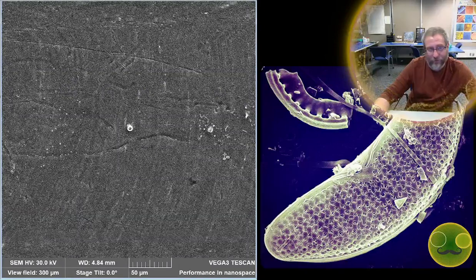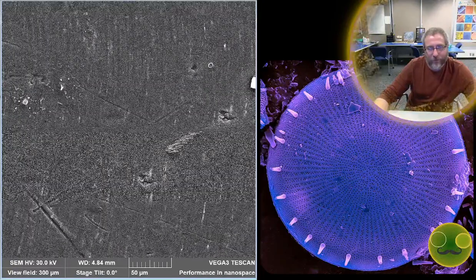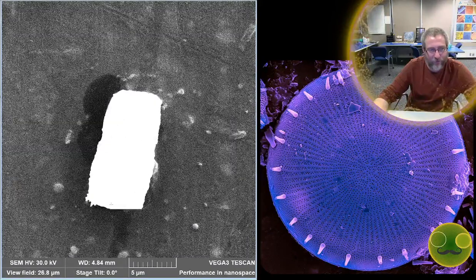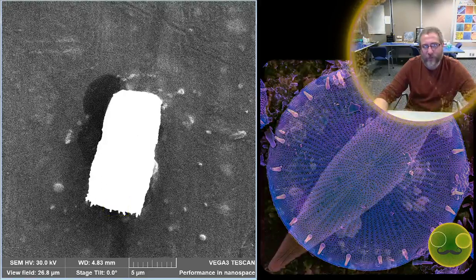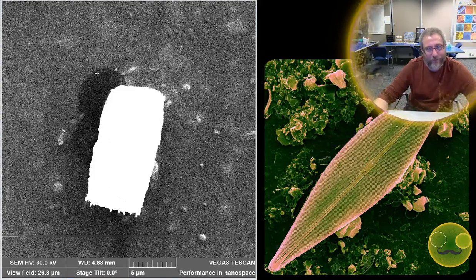I did collect some images of those on Monday, but just one, and I don't know how deformed it was. So this is a girdle view of one of those little beasties, and it's overexposed, so give me a second. The instrument's having a hard time with light exposure today. Not sure why. It's kind of jumping all over the place.